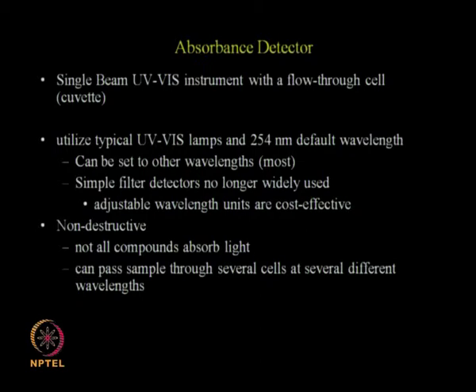We can use different filters to look at different wavelengths also. It is a non-destructive test, that means after you have done the experiment we can collect your sample and use it for some other analysis. That is the main advantage of this type of detector, because if the quantity of the solute is really scarce, you will not have enough of the solute for performing a large variety of analytical measurements.